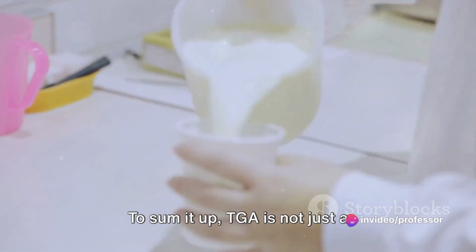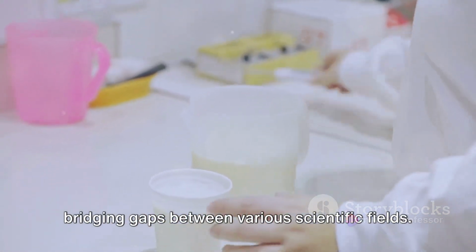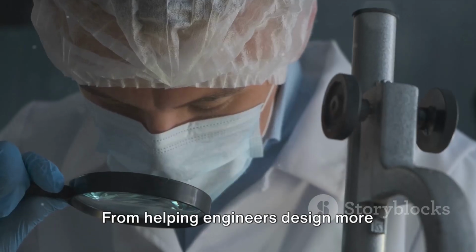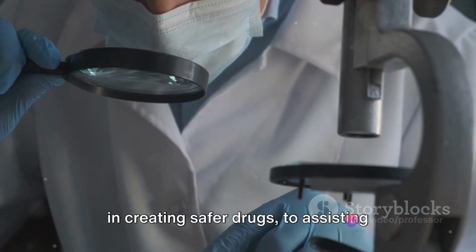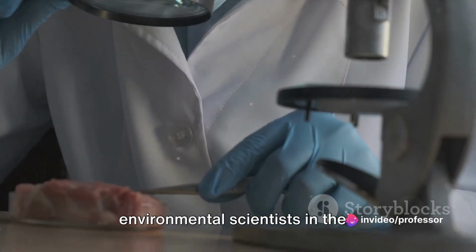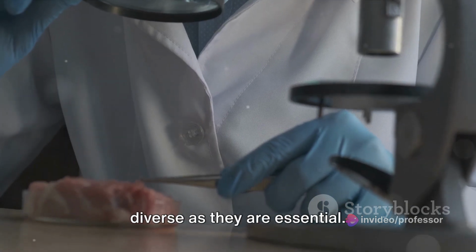To sum it up, TGA is not just a technique, it's a multidisciplinary tool, bridging gaps between various scientific fields. From helping engineers design more resilient materials to aiding pharmacists in creating safer drugs, to assisting environmental scientists in their research, TGA's applications are as diverse as they are essential.